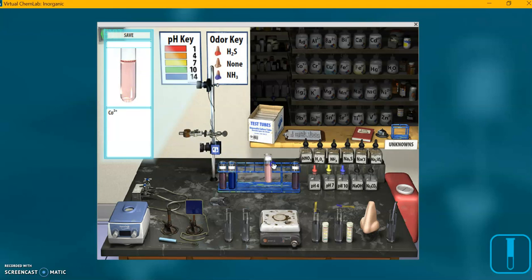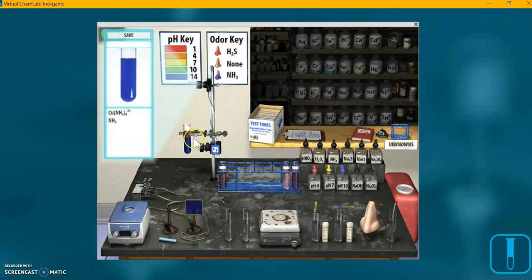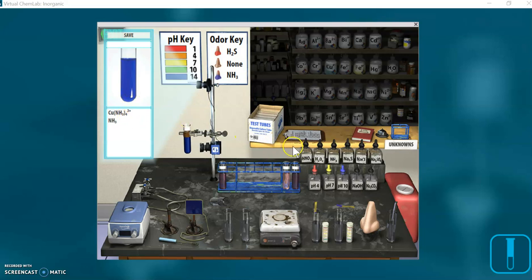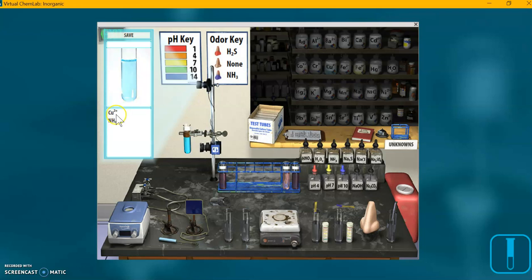We're done with that test tube, so I'll put it aside and grab the test tube with the copper complex, putting it back in the test tube stand. We're going to add some more nitric acid. Before I do, you can see up here we've got this deep blue copper amine complex ion in solution. I'm clicking on the nitric acid — wow, big change right away. Now we have this light blue, baby blue solution, and that shows the copper ion. That is the confirmatory test for copper.